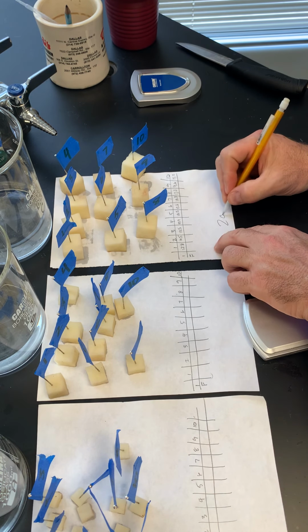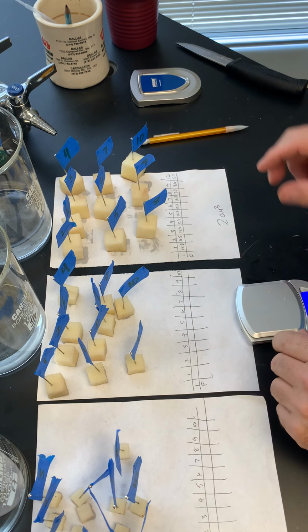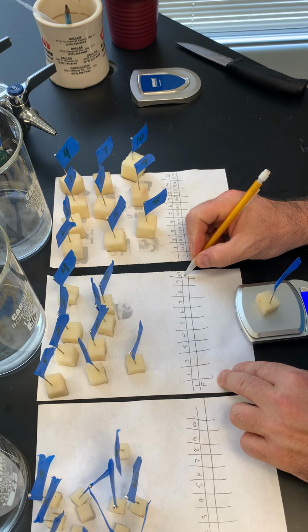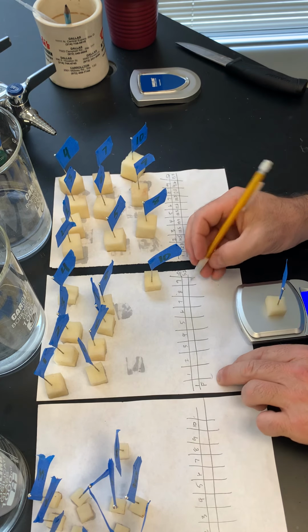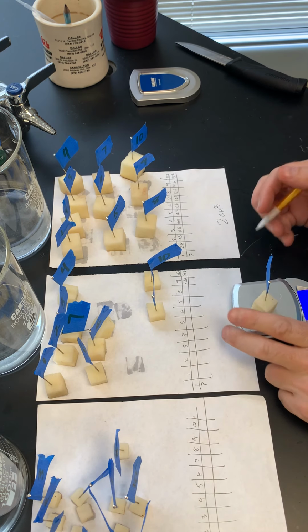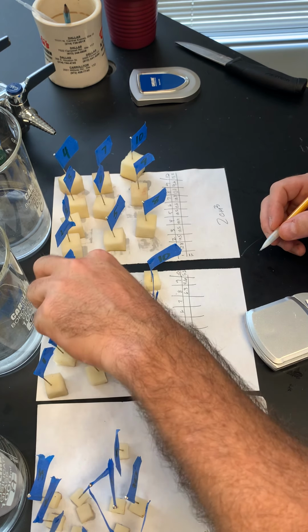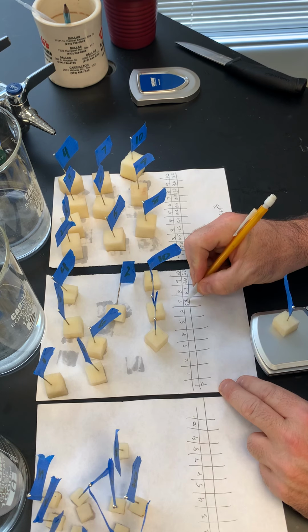So these are all 2 cubic centimeters. So let's go to this group. 5, this is 10, so 5.2. 9, 4.6. Let me make sure this is recording. It is. 4.6, 8, 6.3, 7, 5.3.